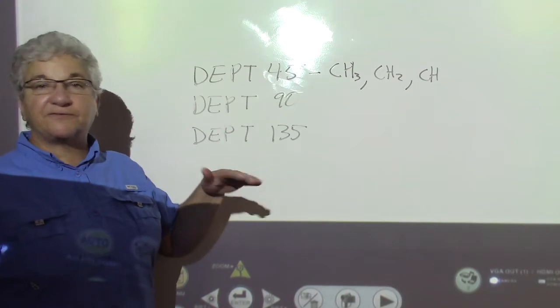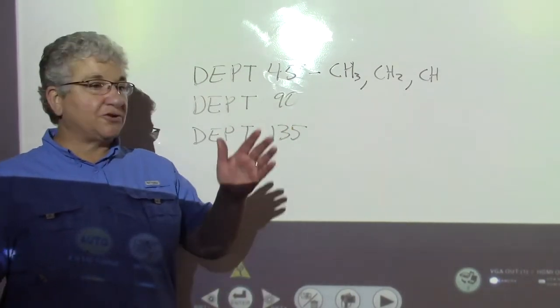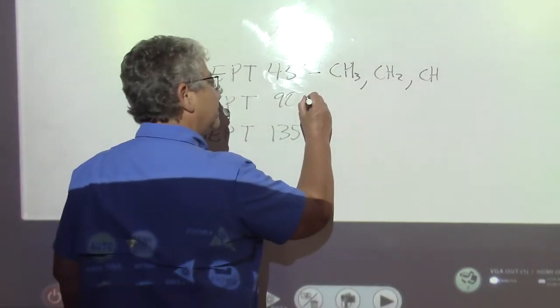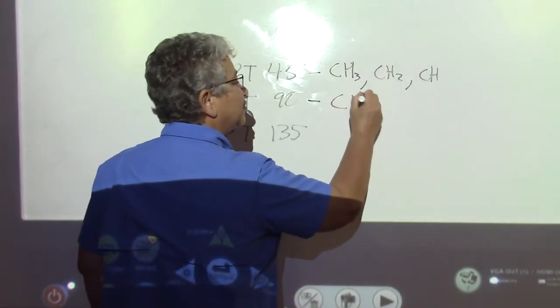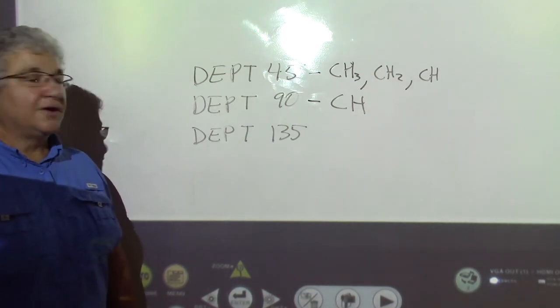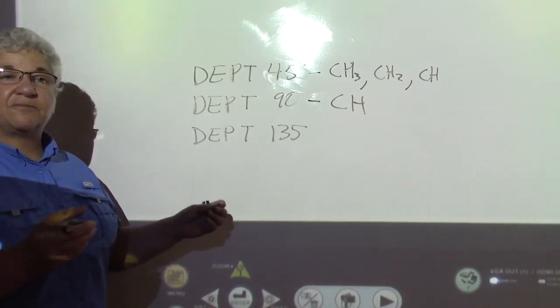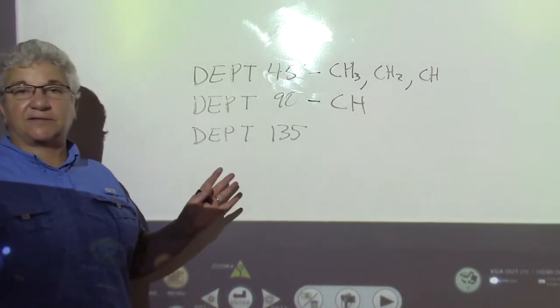Again, the chemical shifts for all of the peaks here will be exactly the same as they are in a C13. So you can just match them up and see which peaks are missing. Now, what does a DEPT 90 tell you? A DEPT 90 shows you carbons that have one hydrogen. So when you look at a DEPT 90 spectrum, you're only going to see peaks from carbons in your molecule that have one hydrogen bound to them. You won't see anything else.